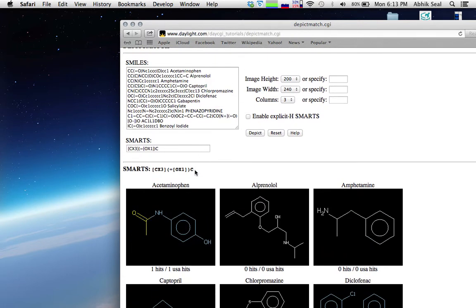The SMARTS string here matches the carbonyl with carbon. If you want to get hits for conjugated pieces like carboxylic acid, carbonyl, or carbonic acid, you can write an alternative pattern.